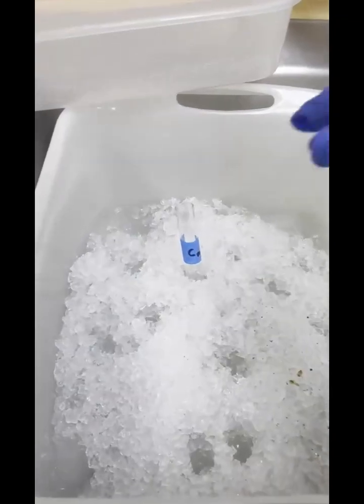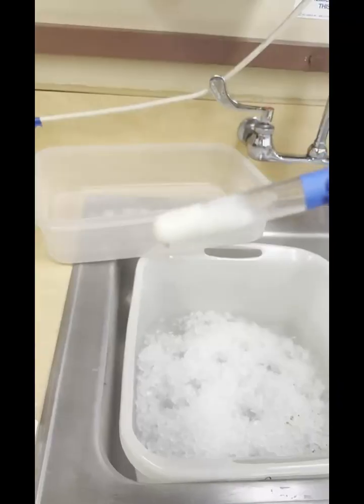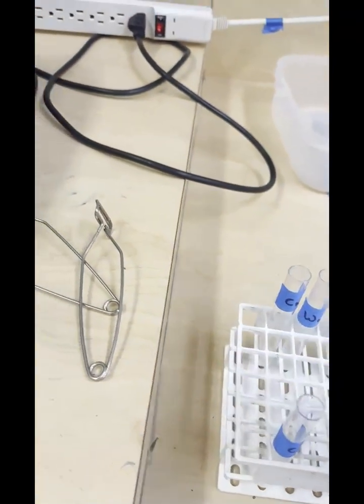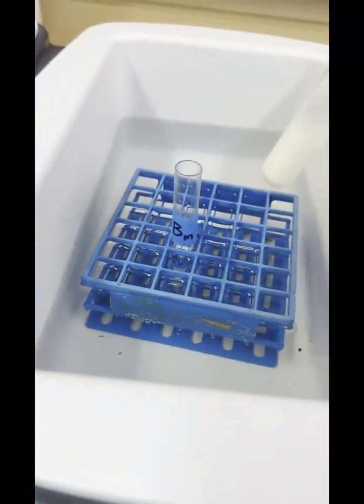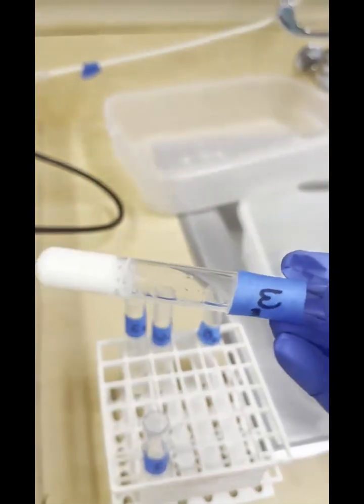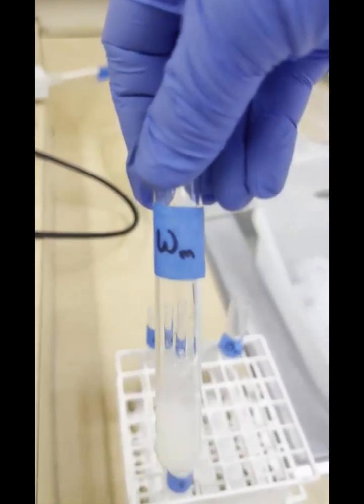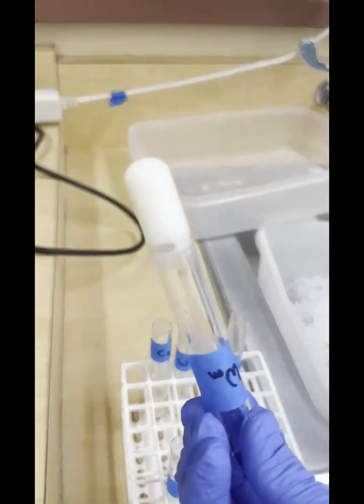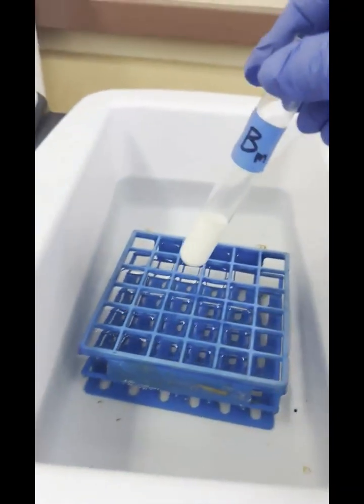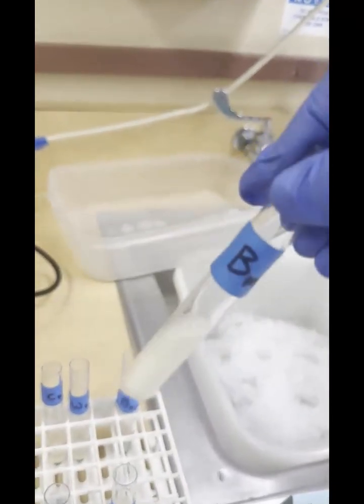Okay, let's collect our test tubes. So this is the cold rennin. You can see it's pretty liquidy. Right. And let's look at the warm. So this is our warm. And it's pretty solid. This is pretty much cheese. Right. And then our hot, our boiling, pretty liquidy as well.